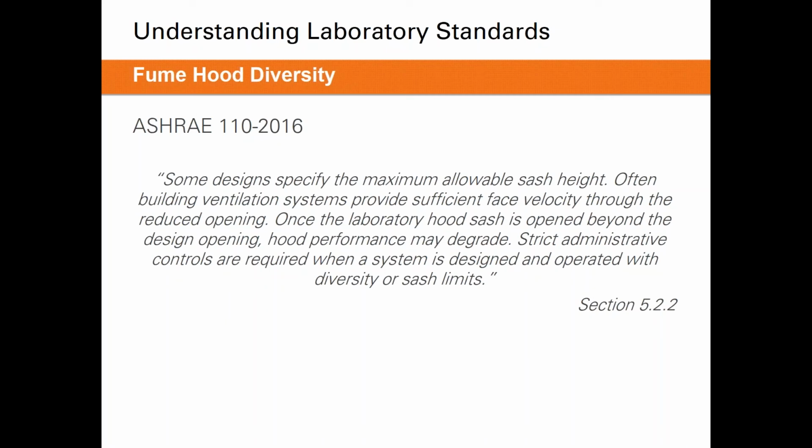Our ASHRAE 110 standard also talks about diversity in a slightly different manner, in that it talks about it in terms of maximum allowable sash height. So building ventilation systems may be designed to keep up and maintain sufficient face velocity through a reduced opening, meaning that we wouldn't be able to maintain face velocity if the sash is at the full open position.